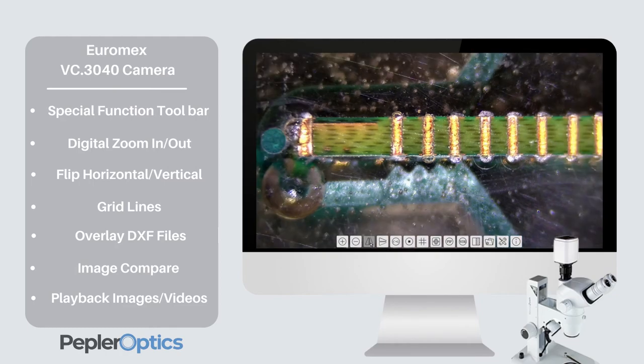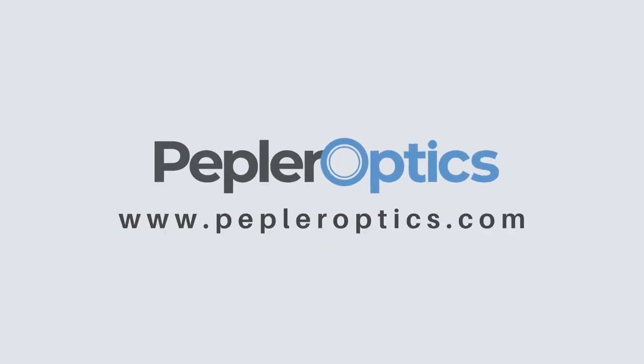The VC3040 camera can be fitted to most microscopes and is a great solution for microscopy in industry and education where real-time images are needed.